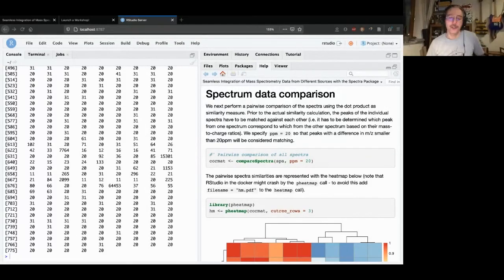In principle, you could simply implement a backend class that understands how the data can be imported, for example, from the .raw files. And that one could, again, use the API from the vendor software to extract the intensities and mass to charge ratio values. We don't have the support available and implemented now, but in principle, it would be possible to do that.